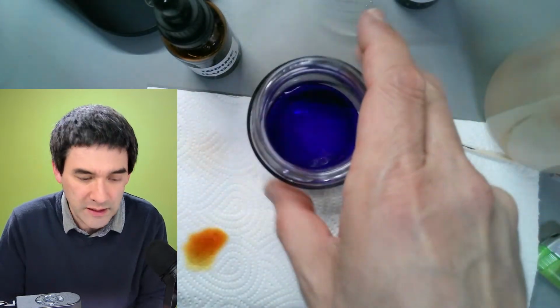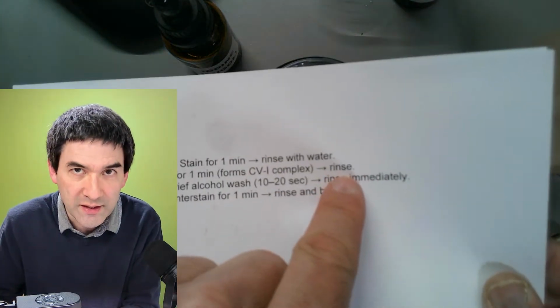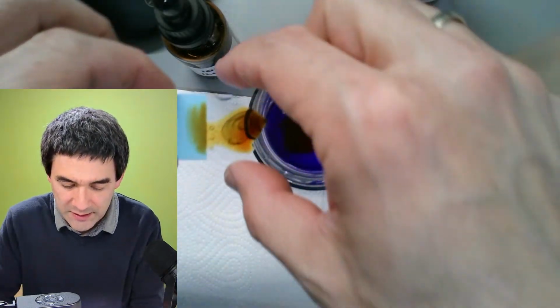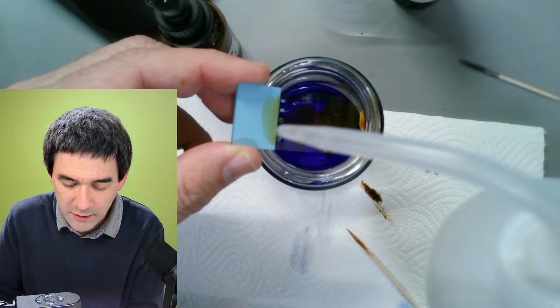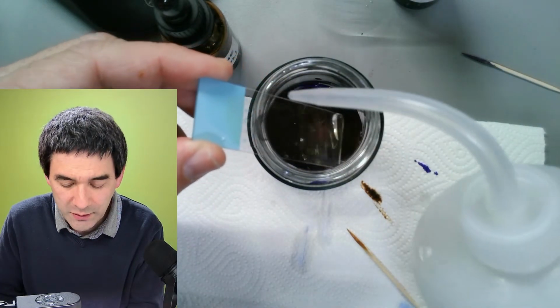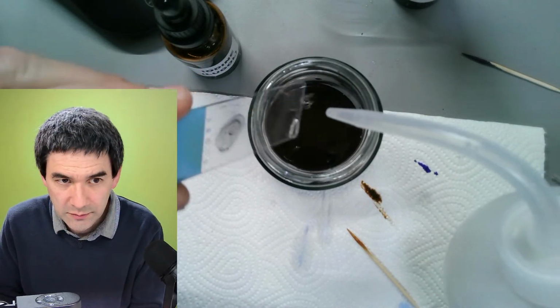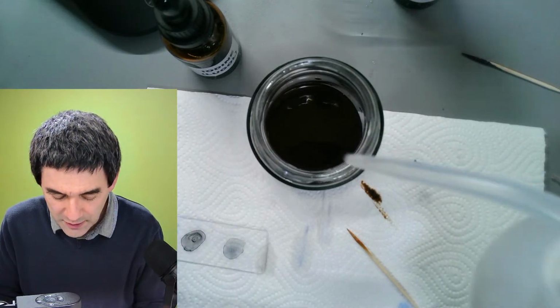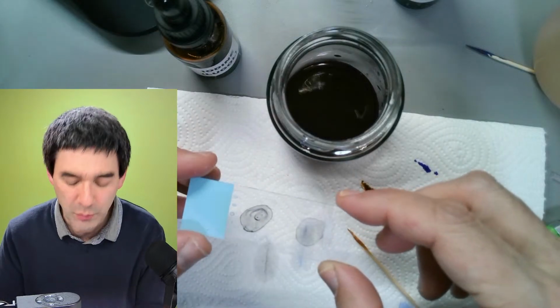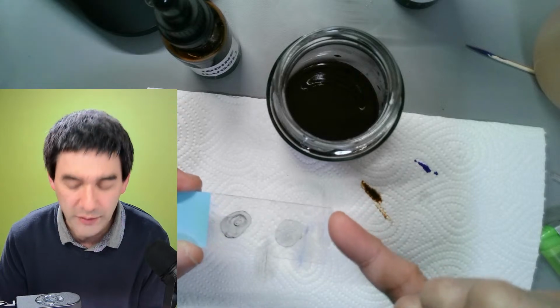So the next step, what does it say? Always follow the instructions. Rinse, of course, and you already know how this works. Now you carefully apply this on top, and here we go. You can see now, that's actually quite interesting. It's not quite as blue anymore. It has become a little bit darker, almost like dark gray or black.